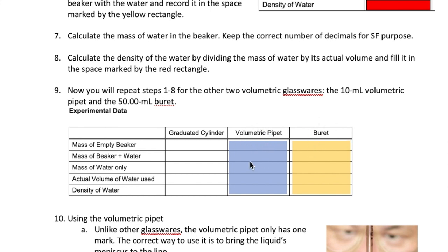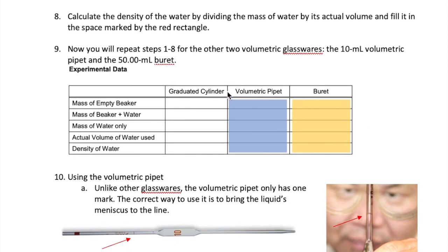For the second column, you're going to do the same experiment, but this time you're going to use a 10 milliliter volumetric pipette to get your sample of water. Pour out the water you have in the small beaker — that was for the graduated cylinder, so we're done with that. Once you pour the water out, dry that small beaker well with a napkin and then measure the mass of that beaker again and write it down.